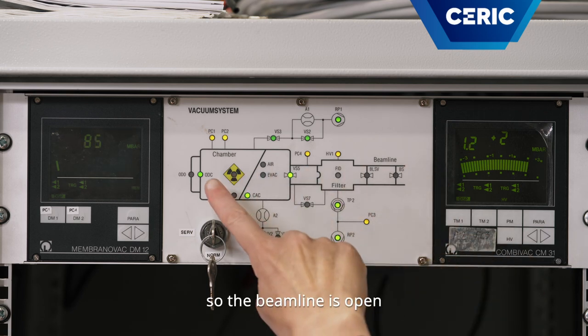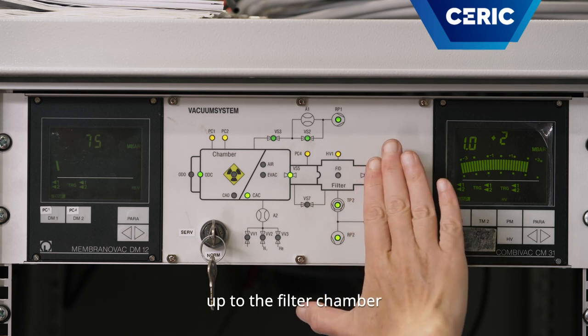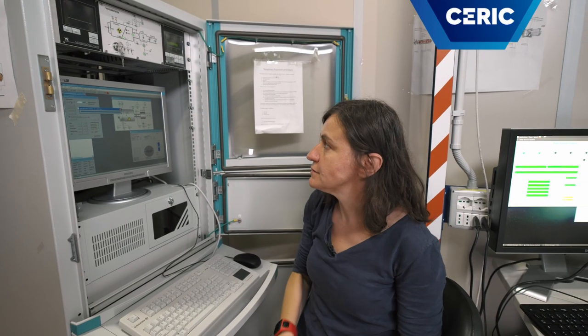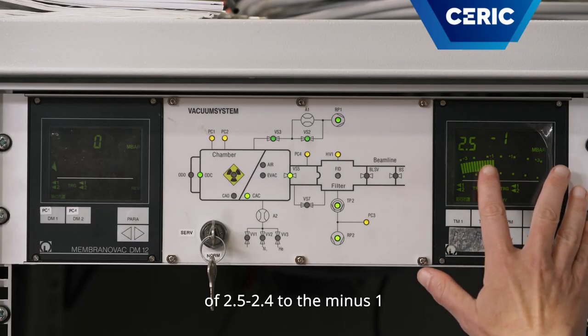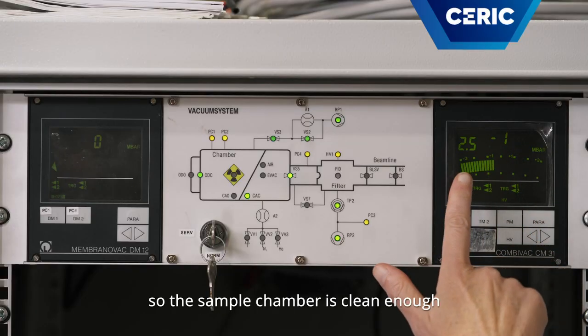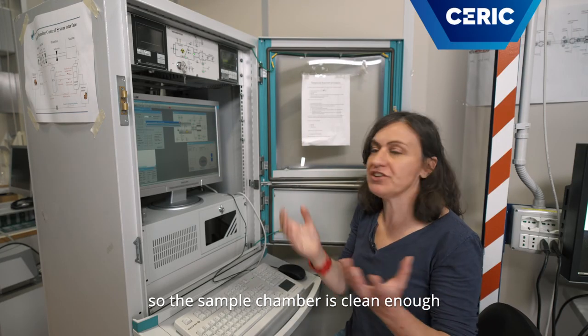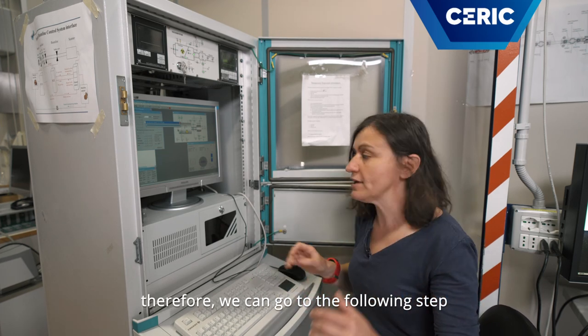So the beamline is open up to the filter chamber. Now we are at a vacuum level of 2.4 to 2.5 times 10 to the minus 1. So the sample chamber is clean enough. Therefore we can go to the following step.